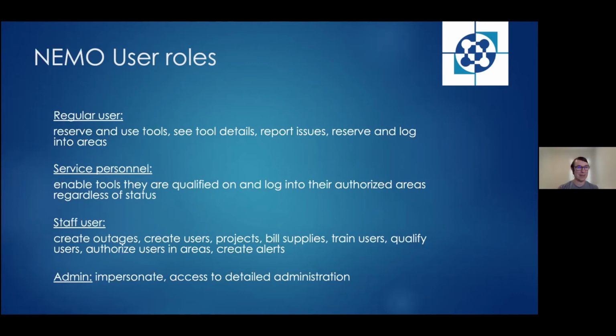And then the final noteworthy role is really the admin role, and that is usually reserved to just a few people in your lab, in your facility. Those people can impersonate others, and they also have access to the detailed administration.